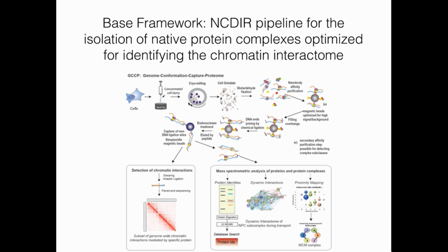That's a great question. What we need to know is in our grindate that we preserved these complexes by glutaraldehyde fixation. And we want to make sure that when we extract, we're also keeping these long-range interactions intact. I hope that we see some long-range interaction. I think I understood your question.